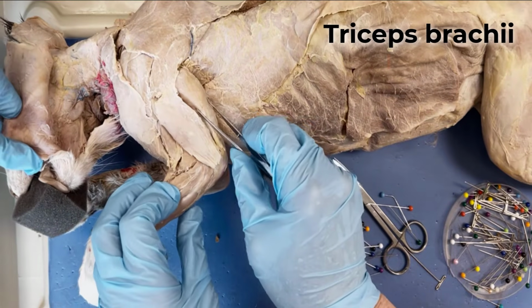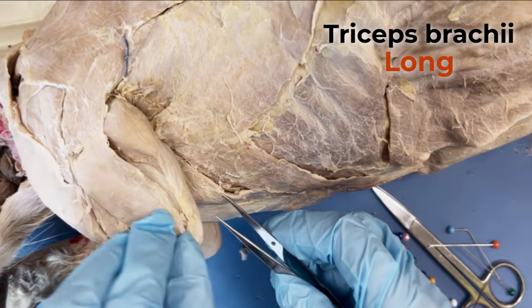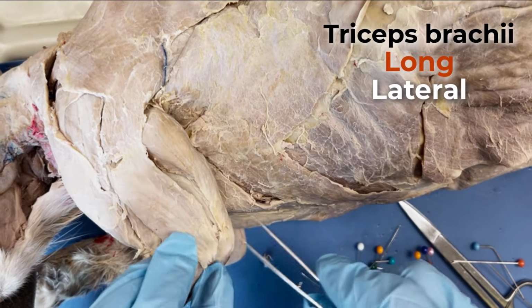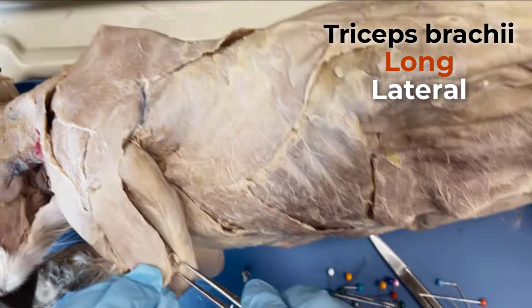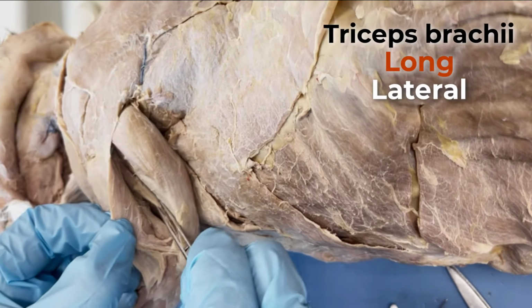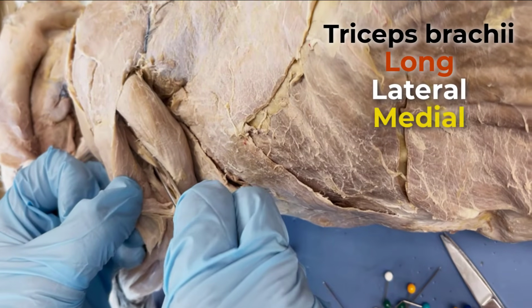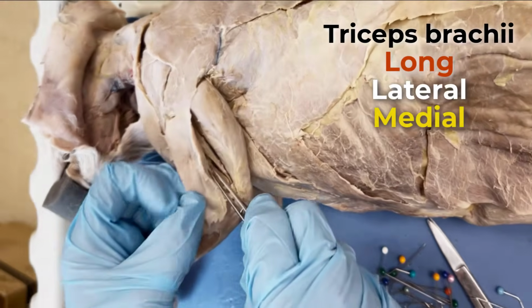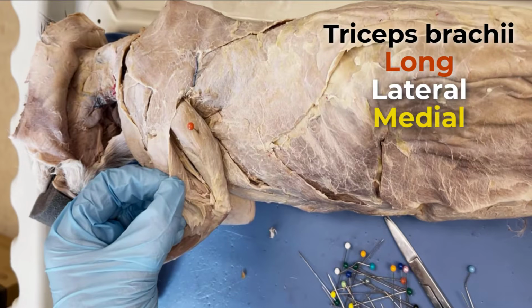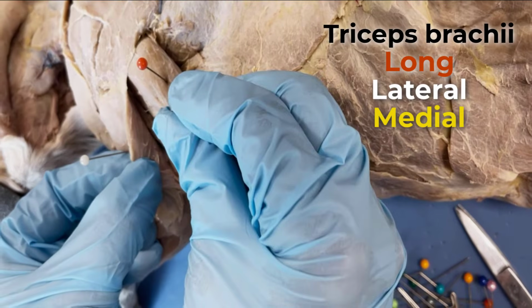We've got the triceps long head here, nice big muscle, and the triceps lateral right in here, so long, lateral, and we've released it from the elbow a little bit so we can move that back, and kind of hiding out deep in here is your triceps, oops, did I get the right one? Yeah, triceps medial. Okay, so long, lateral, medial. Let me get pins in here. Long, lateral, medial.